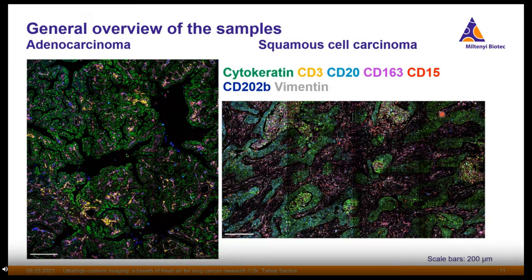It would be more on a 50-50 level. You barely see any infiltration of T cells there. You can see these very weird regions that seem to be necrotic areas because the shape and the intensity of the signal here is very different from the rest. In the stroma area, you have mainly fibroblasts and myeloid cells and almost no blood vessel marker here. So I would say that here we do not have infiltration apparently.